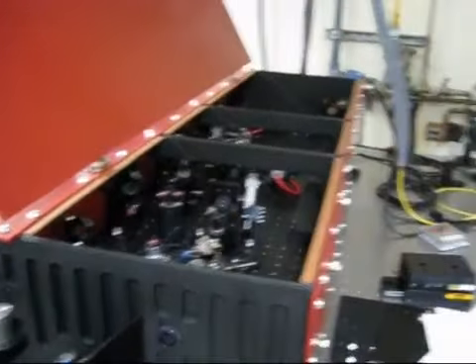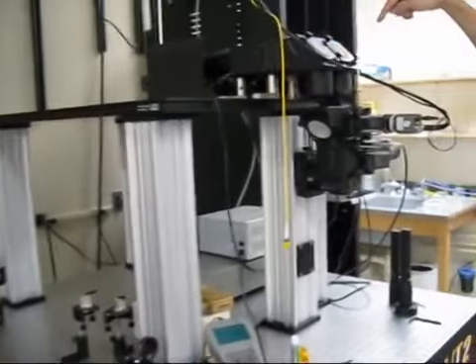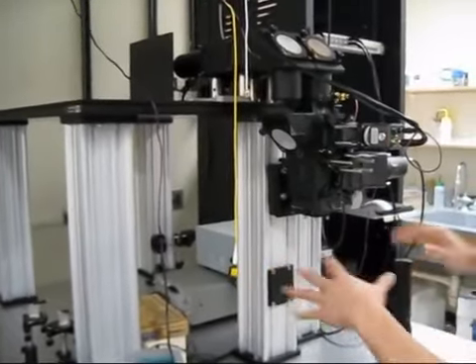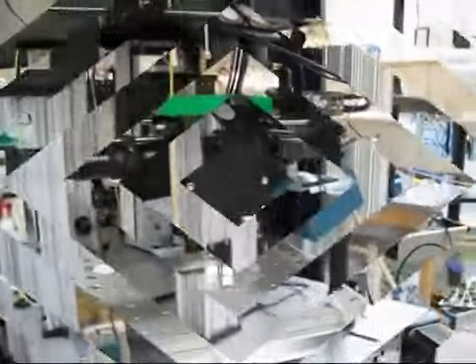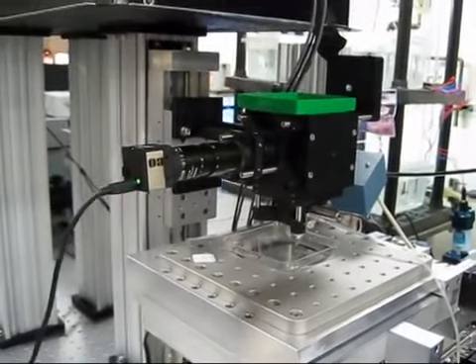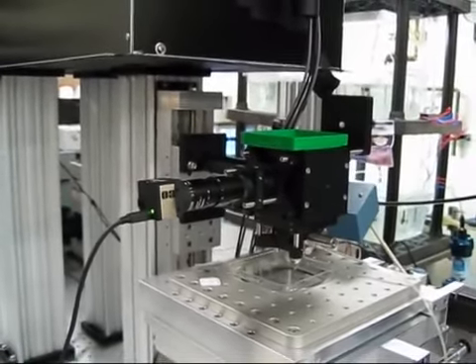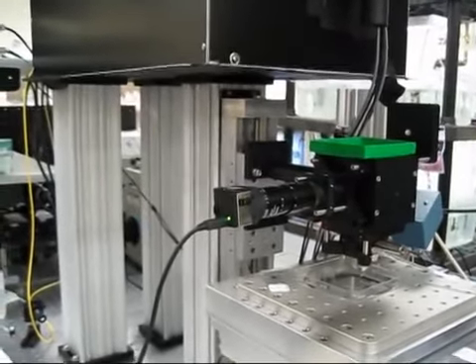From here the femtosecond pulses come up through the scanning system and are scanned across the sample. We've removed the microscope stage right now, but the finished product will look somewhat like this — objective lens here. This happens to be single photon, so we have a 473 nm DPSS laser scanning the sample.